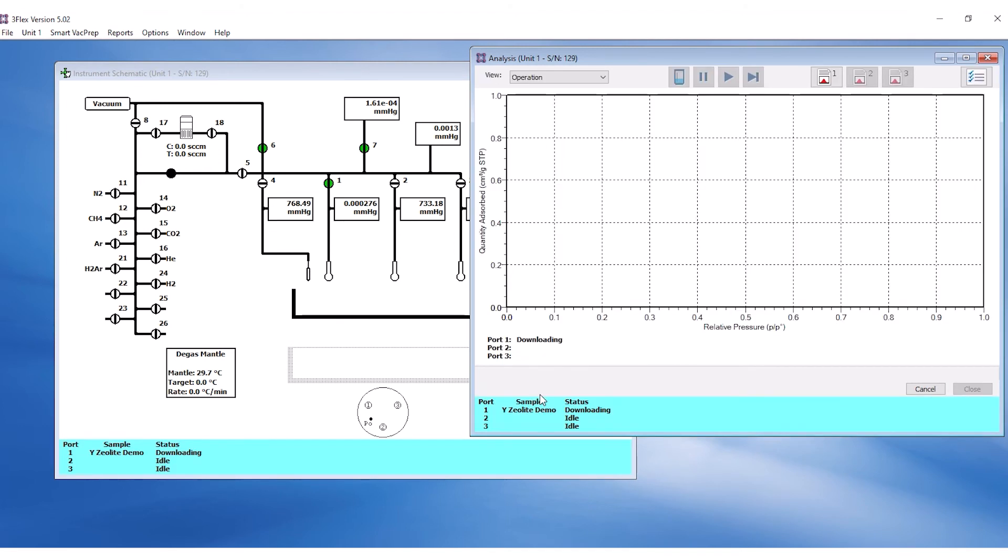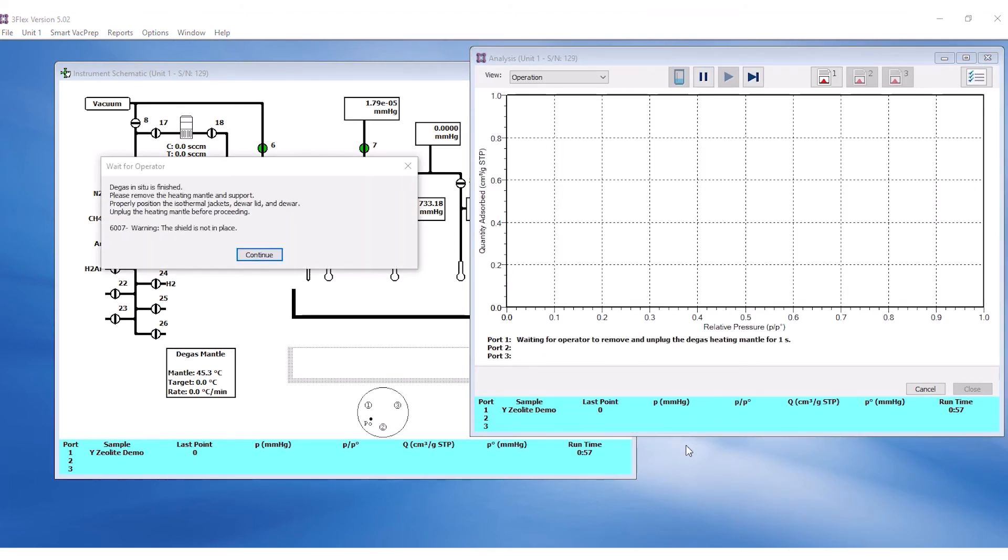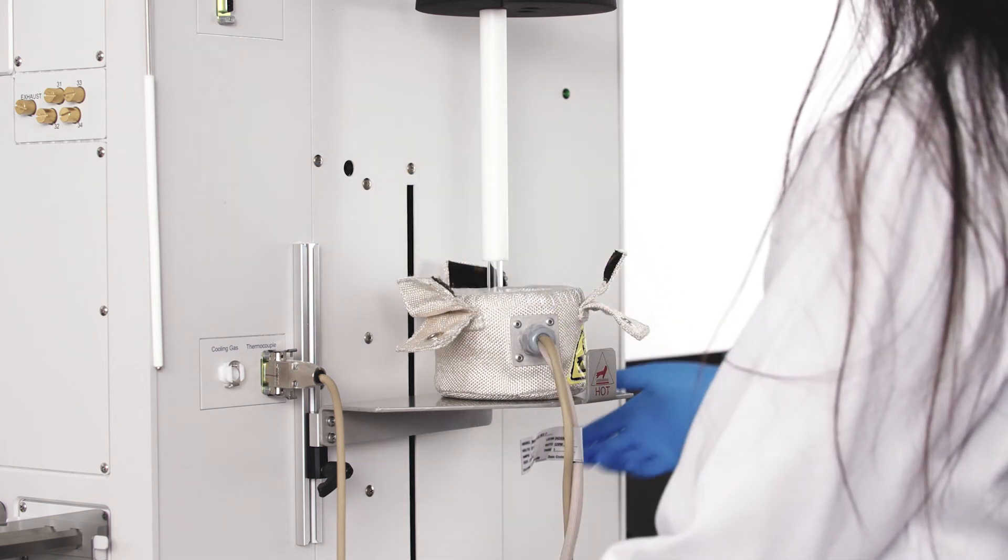Once the in situ degas is completed and the mantle is cooled down, the software will prompt to disconnect the mantle. Uninstall the mantle and the mantle shelf.